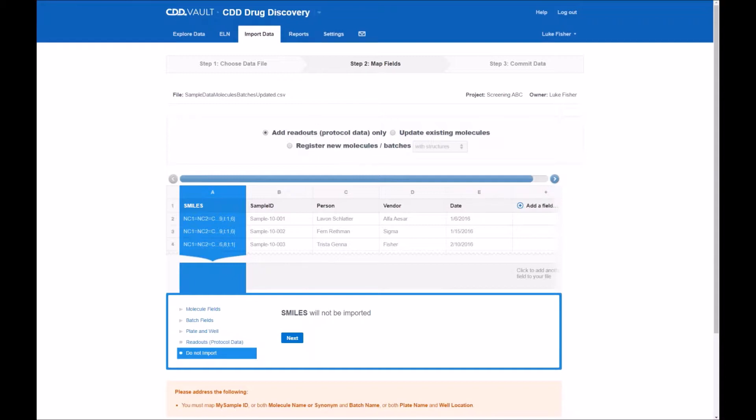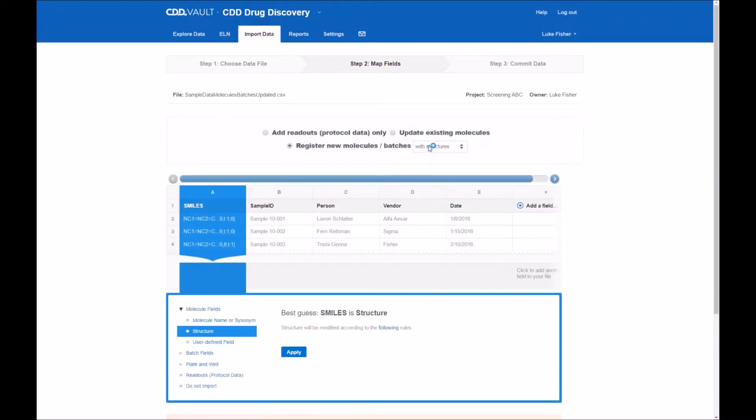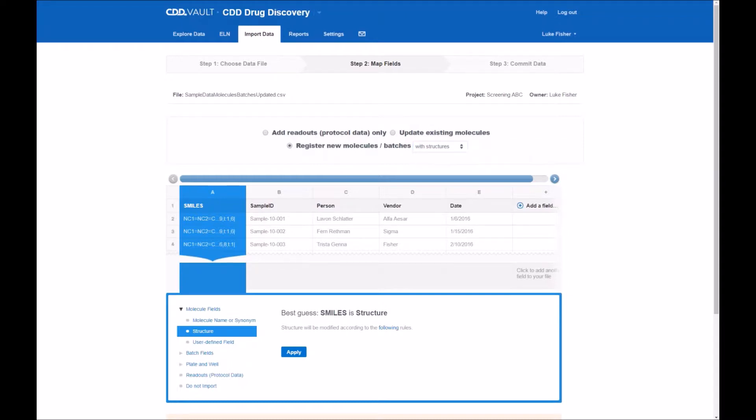We're going to go through each of these different import operations in other videos including the default about reading in biological data or the protocol data, update existing molecules. But here today we're going to register new molecules and batches. These do contain structures as shown in the smile string column but you can also import without structures.